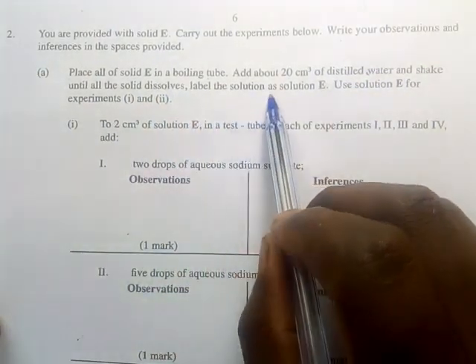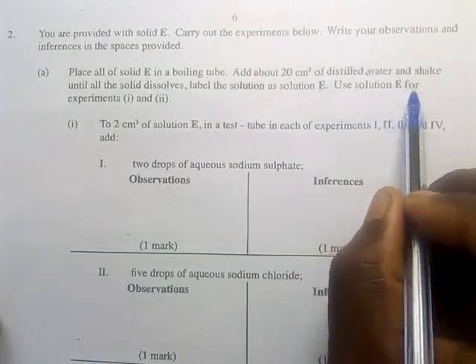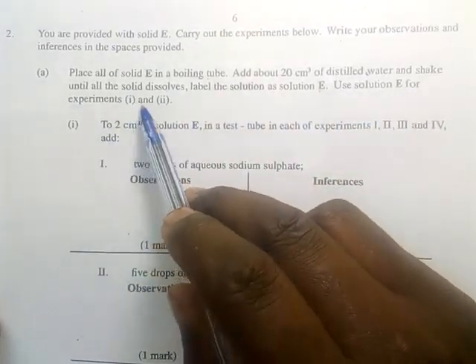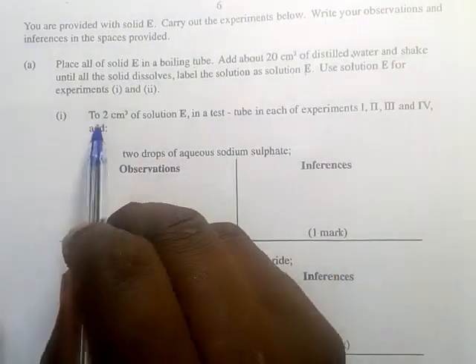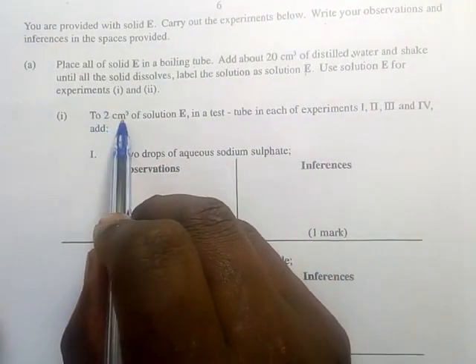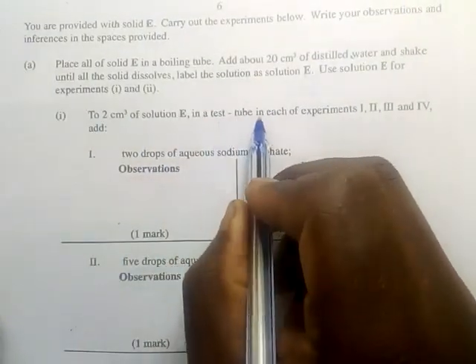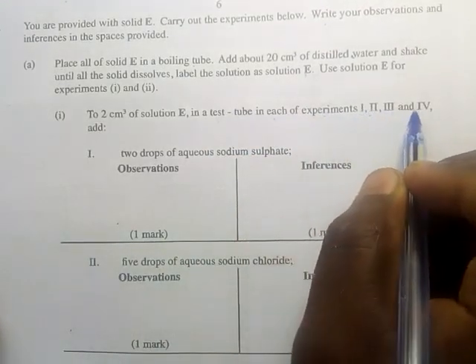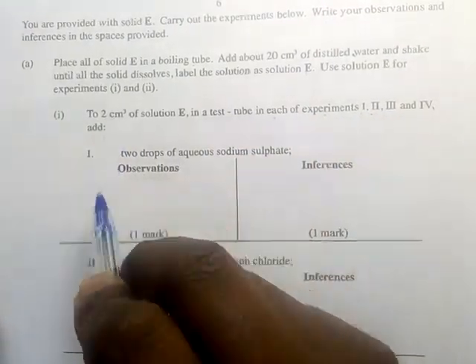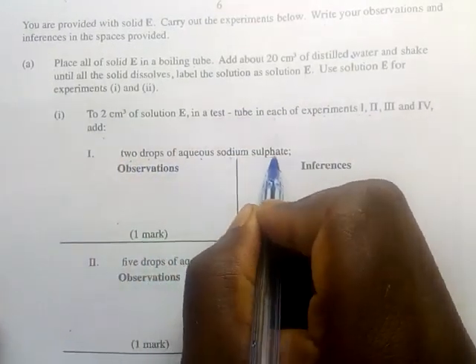Label the solution as solution E. Use solution E for the experiments Roman 1 to Roman 2. So Roman 1, 2 centimeters cube of solution E in a test tube. In each of the experiments Roman 1 to Roman 4, add 2 drops of aqueous sodium sulfate.